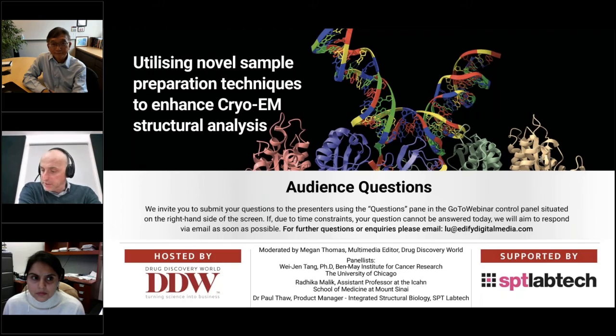Question for you, Wei-Jen, actually. It seemed quite apparent from your talk that the open states of the proteins were not really doable by crystallography. If you look at the closed state versus the open state data you have now, is there some giveaway in there about why crystallography doesn't work for the open states, or is it more that the open states are very transient in respect to the closed state?